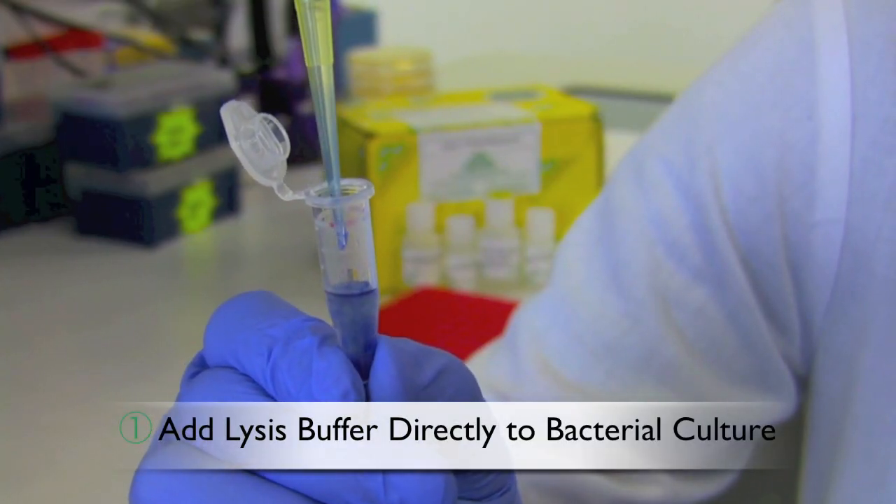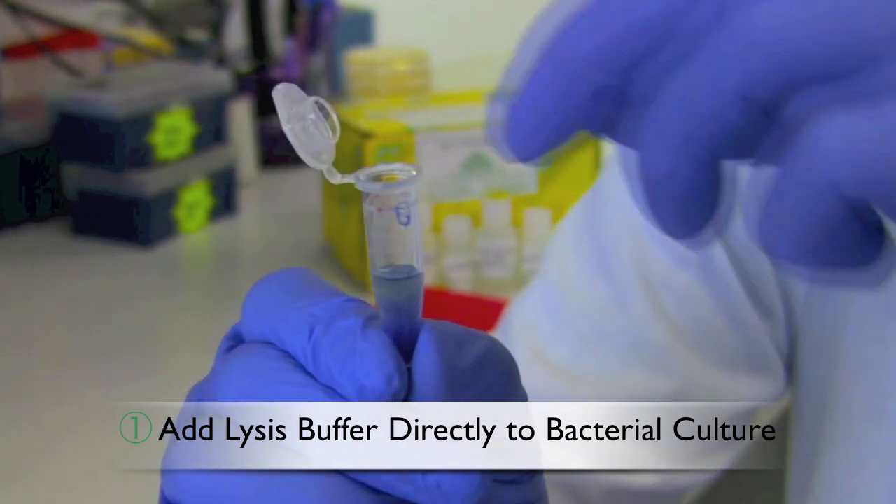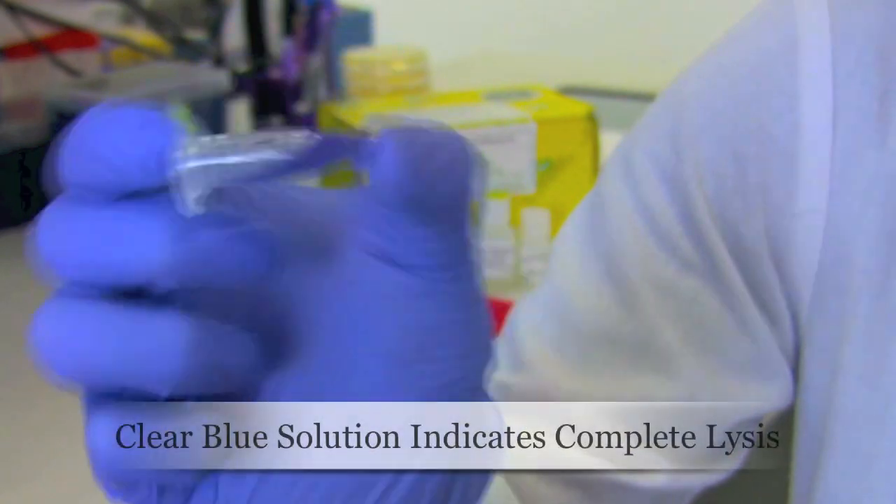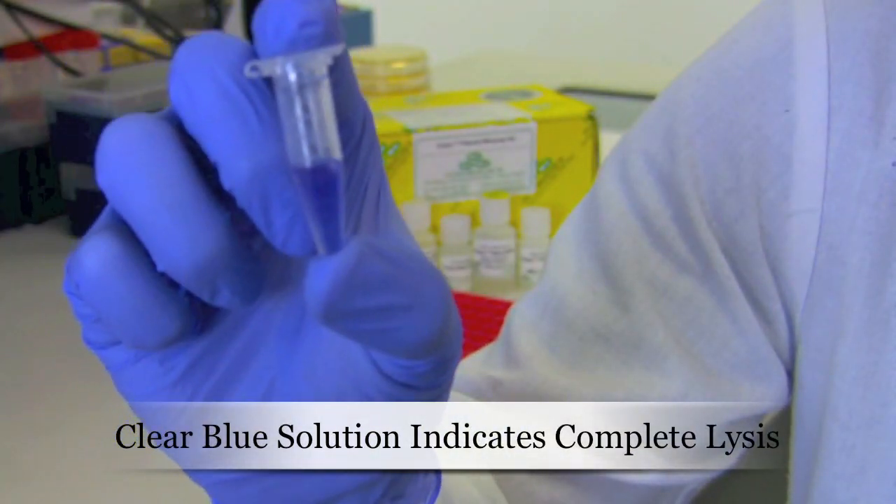Step 1: add 100 microliters of 7X lysis buffer to 600 microliters of bacterial culture. Mix thoroughly by inversion until the solution is blue throughout.